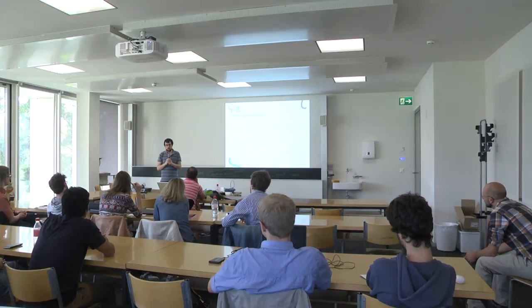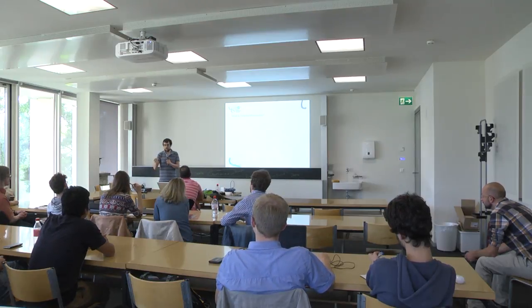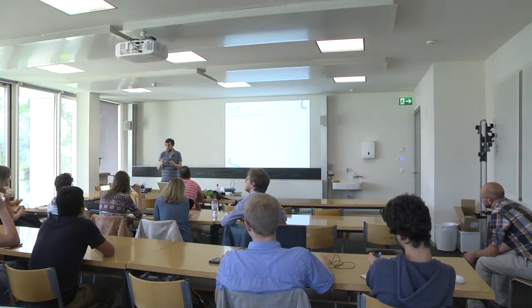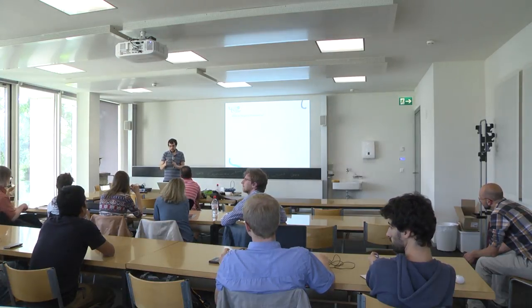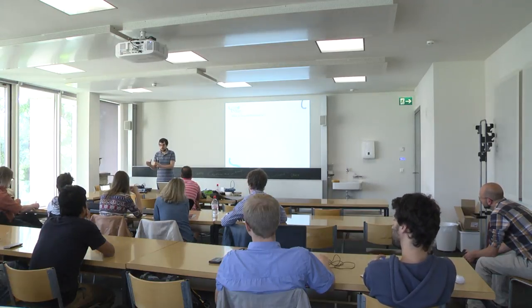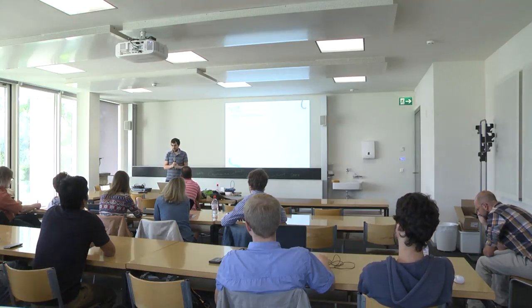I think it's important to have both things. These acronyms facilitate communication, but in your heads, always think how I'm operating the mass spec and how I'm analyzing the data, right? In this way, we can say that this same acquisition method in some cases can be a targeted proteomics approach, and in other cases can be a non-targeted approach.